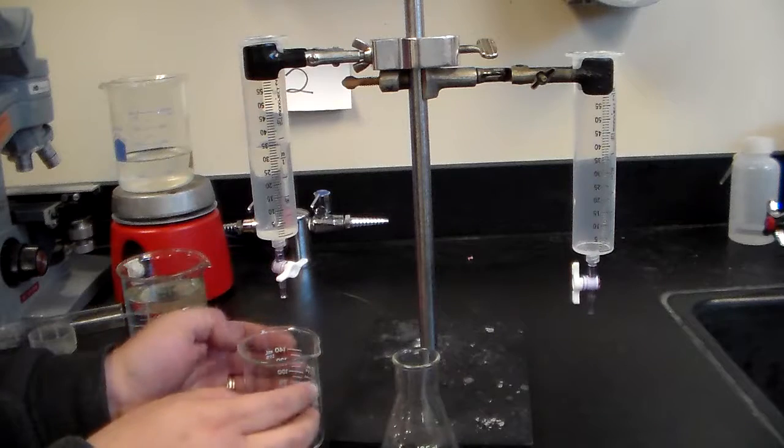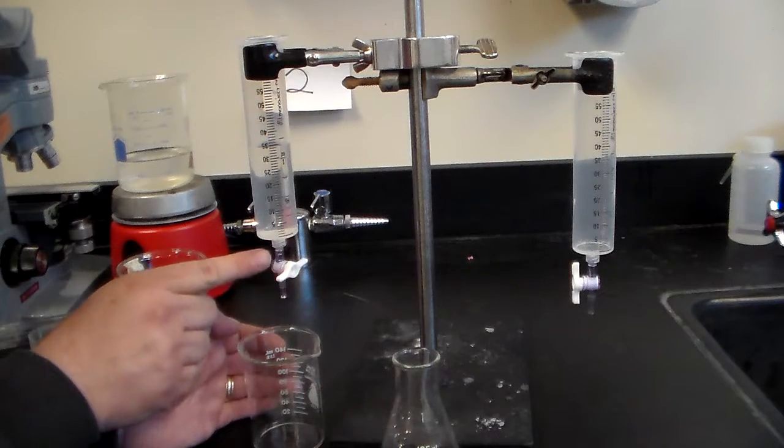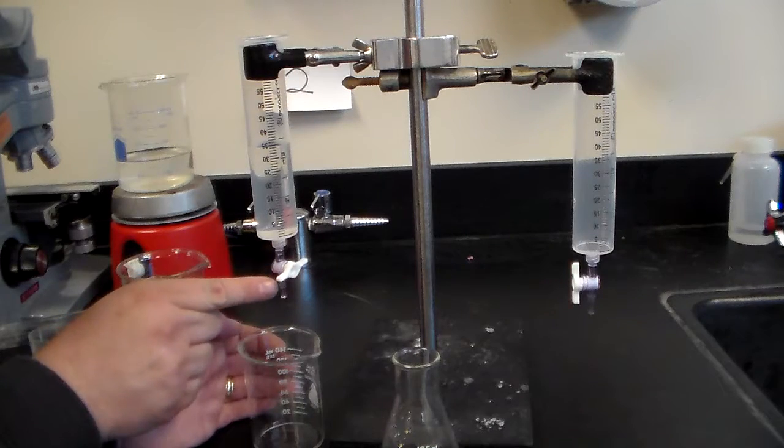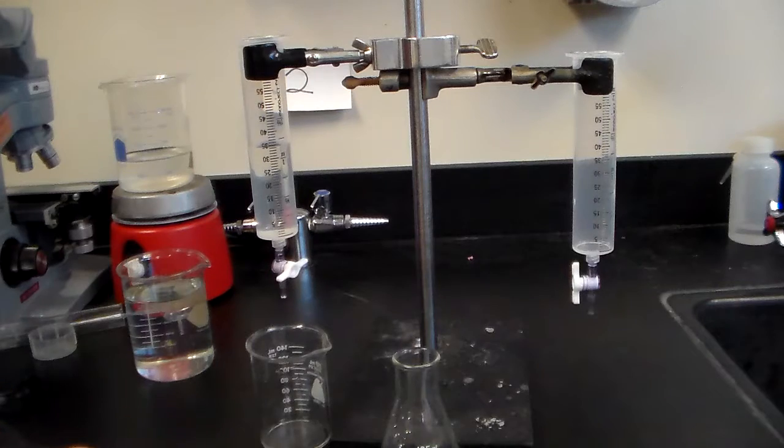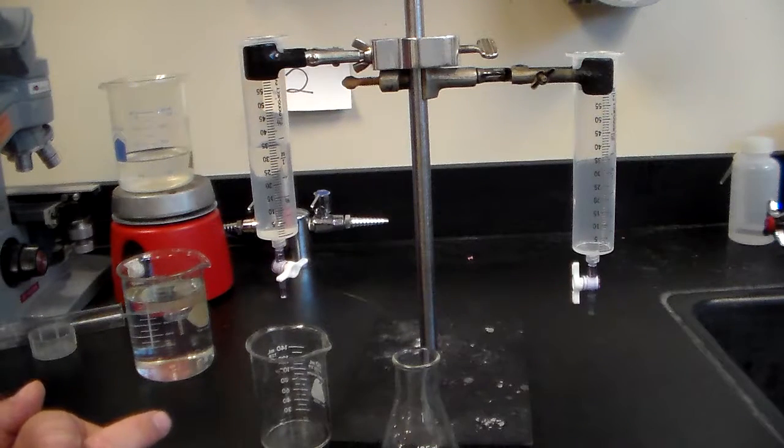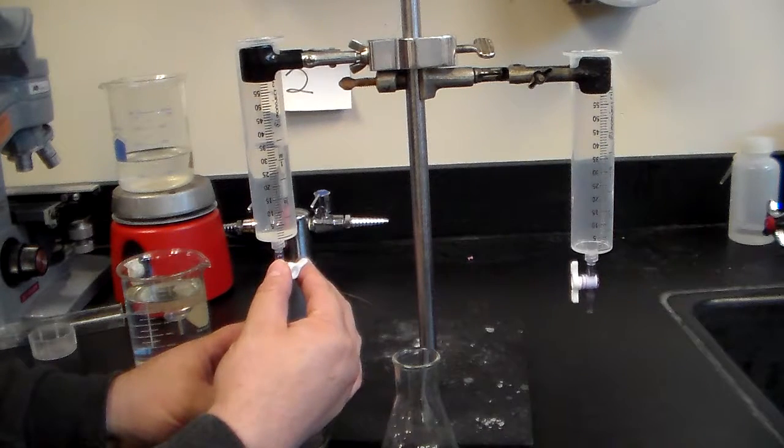How do we operate the burette? If you take a closer look, you're going to see air bubbles in the spout. We need to clear those air bubbles out because that will give us a bad reading in terms of volume.